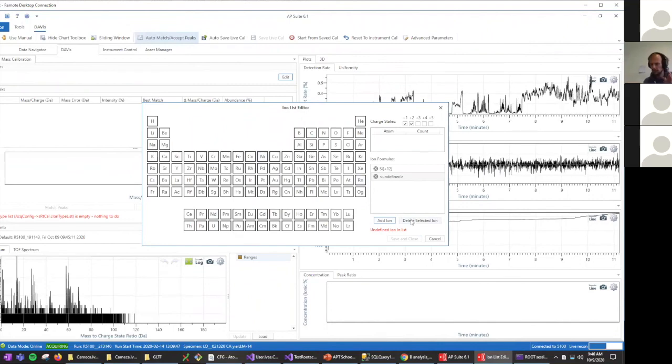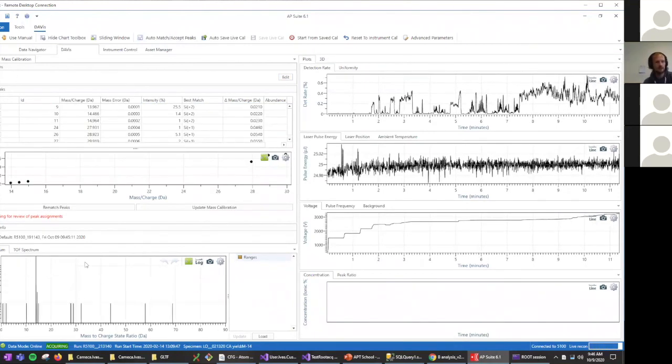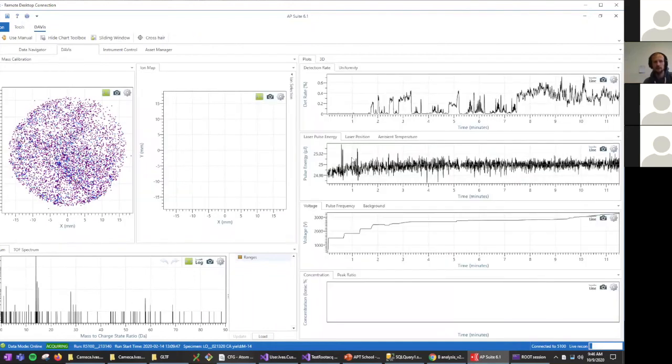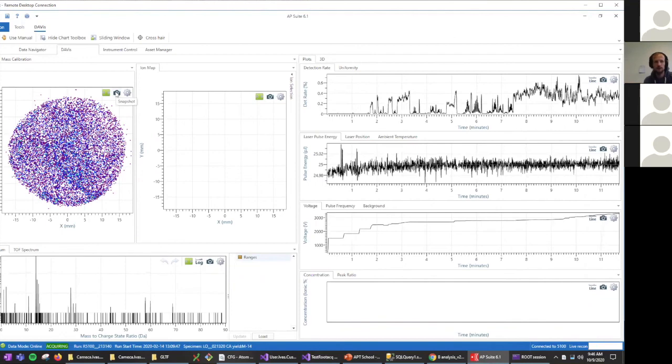They always bring up this idea about ontologies, and they bring up this idea about uncertainty quantification. And if we're strict, at some point in 2 years or 3 years, we will start discussing, okay, well, what is the uncertainty of these data? And then eventually people will start discussing implementations. And they need to discuss how certain things like isosurfaces are implemented, because that is one of the building blocks to come up with absolute precision and error margins. I think there's no way around that.